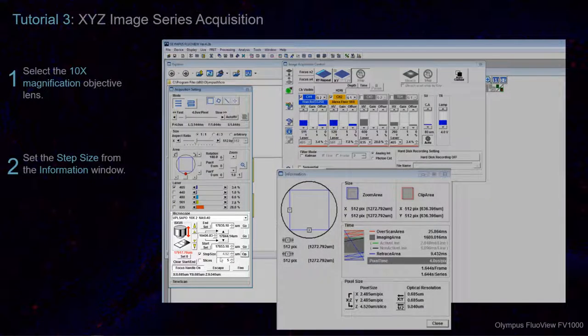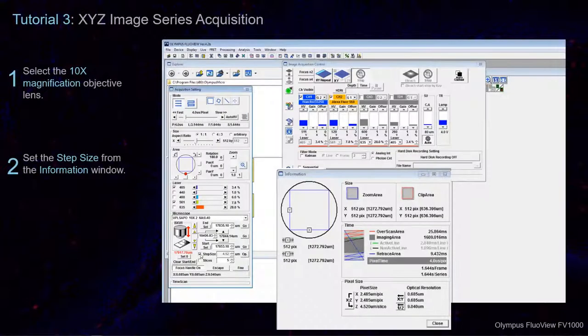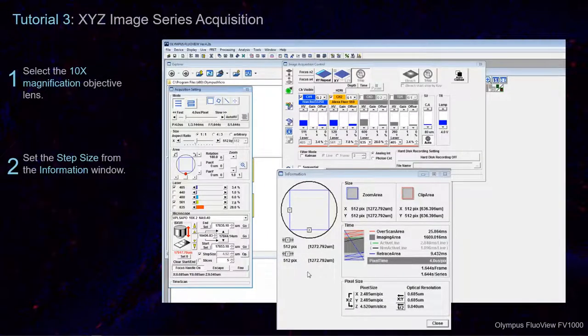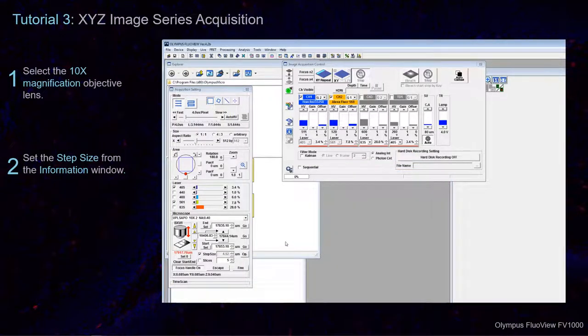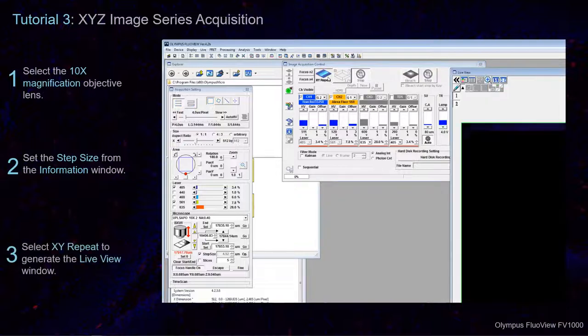Note that you can check and uncheck these boxes to lock the Step Size or Number of Steps. Once you have set the Step Size, close the Information window. Then, select XY Repeat in the Image Acquisition Control window to generate the Live View Scan.